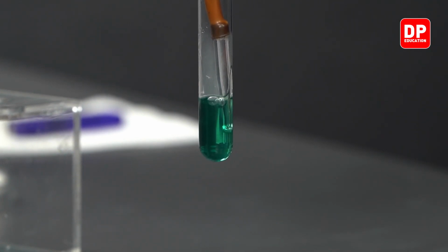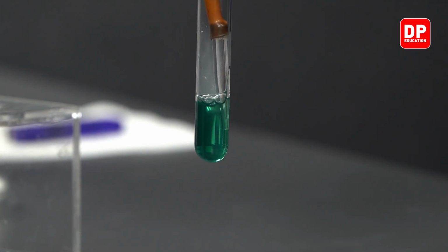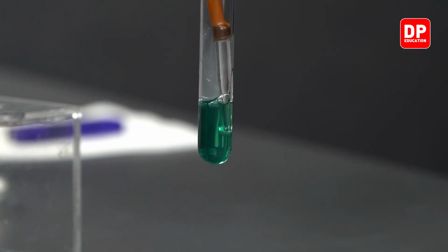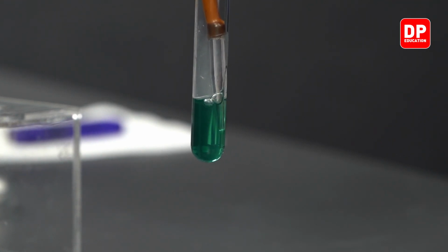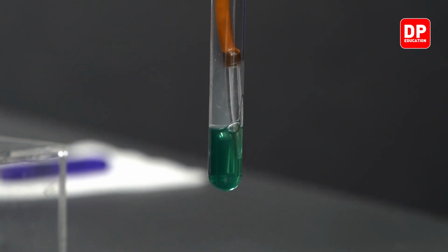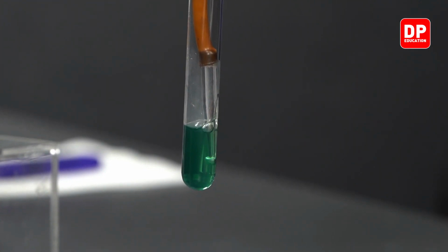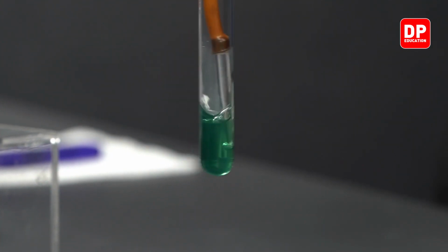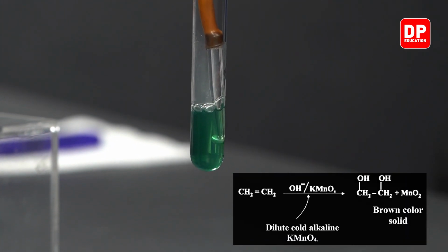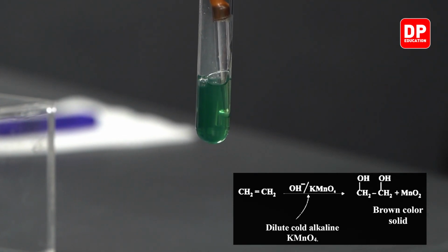First thing that we observed was the purple potassium permanganate alkaline solution turned into a green color. This is due to formation of potassium manganate or manganate ions. Manganate ions are green in color, but now you can see this green color is gradually changing to form a brown suspension.